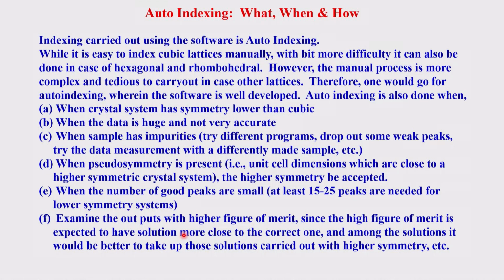And what is auto indexing? When do you do it? How do you do that? All those things are there. How exactly is not shown in this, and this will be there in the program itself, because a lot of parameters are being introduced into that.